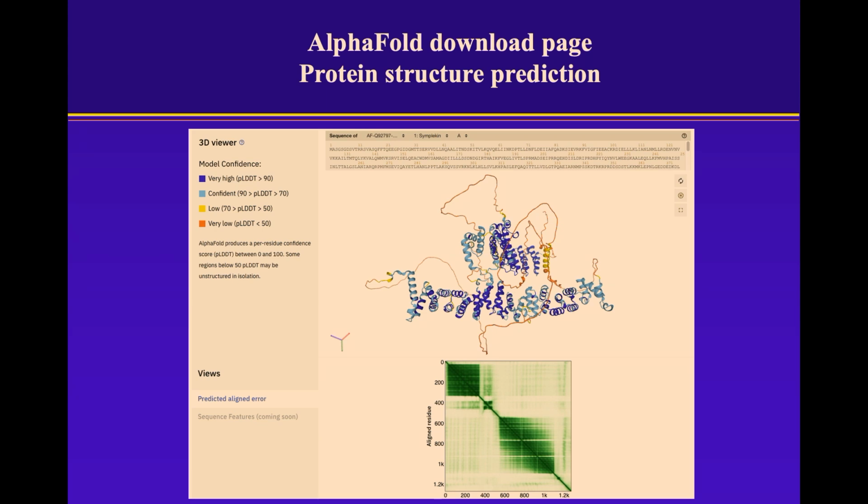But anyway, when you do find your homolog, it shows you the predicted model right here, colored by the AlphaFold color scheme, which is basically confidence, how confident you are in the prediction. Blue is very high confidence. Cyan is good confidence. Yellow is okay, maybe, maybe not. And orange is, don't even think about it. Okay? So you can see that this structure has a domain right here, an alpha solenoid. Do you know what that is? Alpha solenoid, alpha helical repeats. That's predicted pretty nicely.